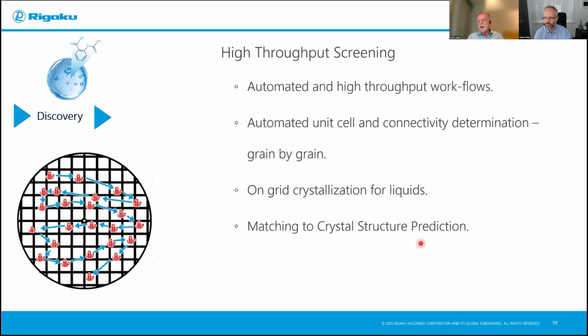But another approach is to do very early polymorph screening, collect structures of multiple polymorphs as soon as you can, and then calibrate the force fields you're using in your CSP to the actual structures you're measuring at the early stage. Again, electron diffraction is very well suited to this. At the early stage, you have a lot more impurity profiles. Those impurity profiles act like random fields.